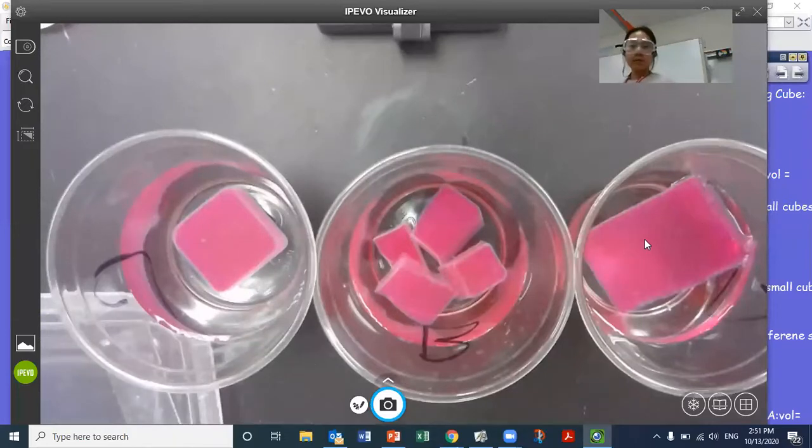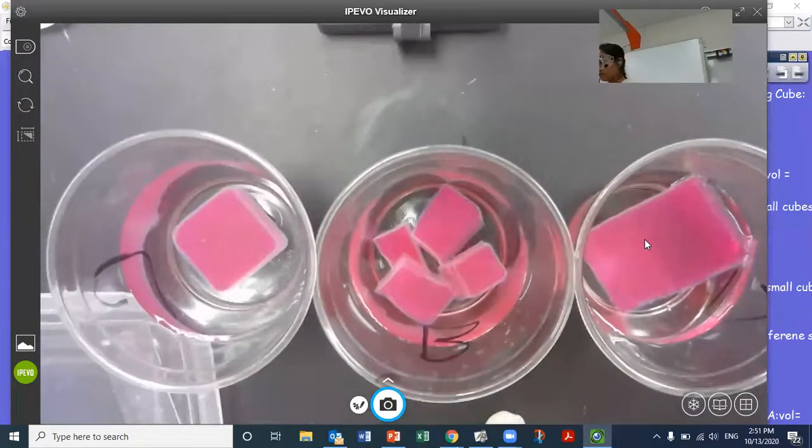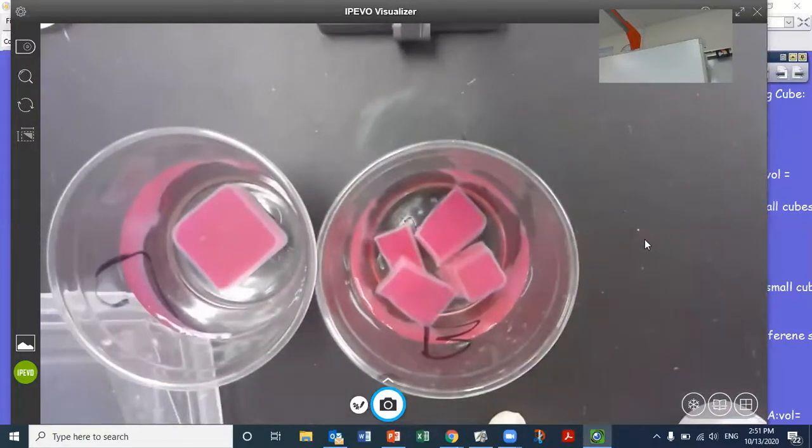And so if you are taking a peek, you can already see that the edges of these are turning a little bit white. And that's because naturally diffusion is already kind of happening. And I'm going to go add a little bit more water into this one, just so that our concentration stays the same.